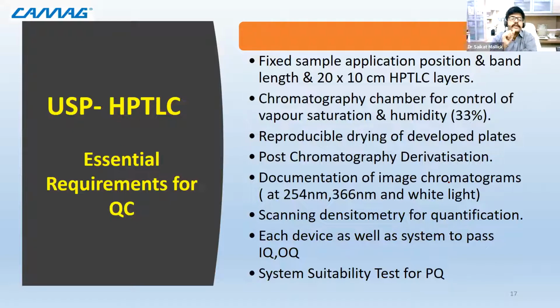And then finally, your instrument should be validated, that is IQ and OQ. In any pharmaceutical company or industry, IQ and OQ is an important aspect. It tells you that the instrument is in perfect condition and that the purpose for which you procured it is being justified. So IQ stands for installation qualification, OQ stands for operational qualification. The instrument which you use should comply with these two things, so that you are rest assured that the instrument you have is of a particular quality.